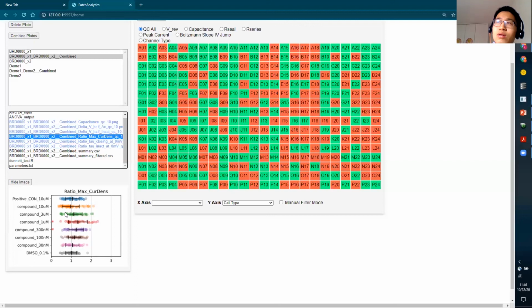Oh, so that would avoid the problem of averaging the slopes. It's a well-known thing that if you have curves with identical slopes that are shifted relative to one another, if you average the data, you get a slope which is shallower than any of the observed ones. But you do it in a way that avoids that. That's correct. Good.